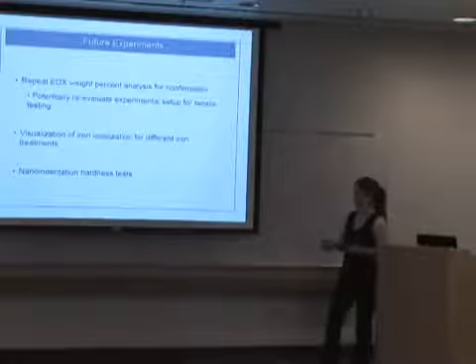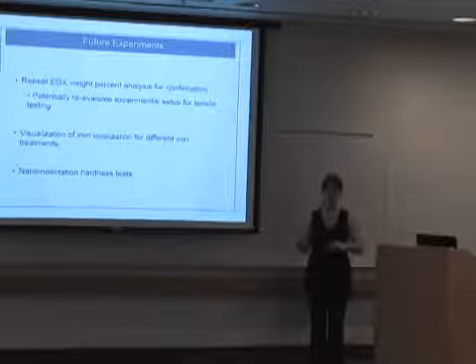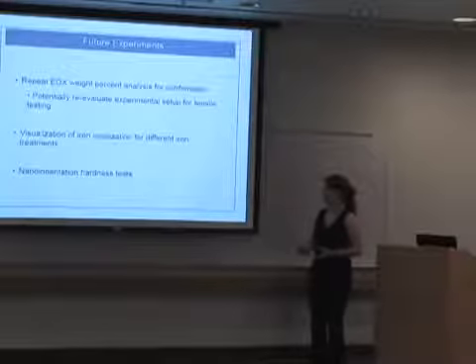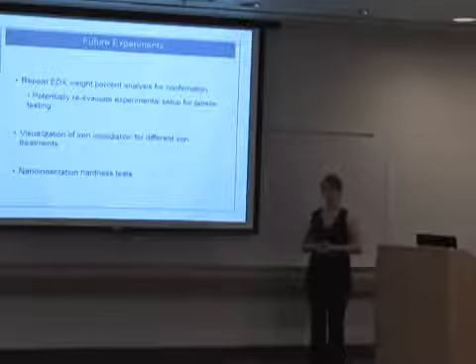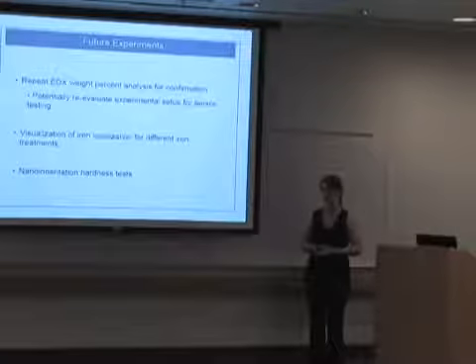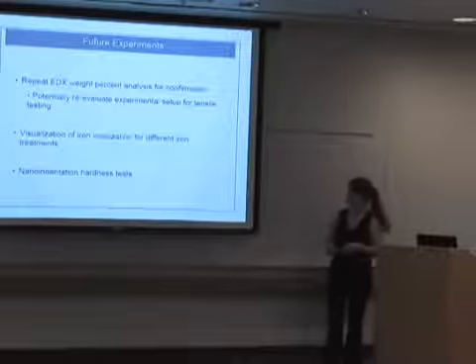So what I hope to do next is to repeat this EDX analysis just to be sure that what's happening is that the iron is not bonding with the DOPA in the threads. And if that's the case, I need to reevaluate the setup of my experiment. If there's oxygen present, that could be causing the iron to be oxidized, which could be putting it into a form that makes it so it can't form the crosslinks with the DOPA. And I can try and think of methods to remove as much oxygen as possible from my solutions.